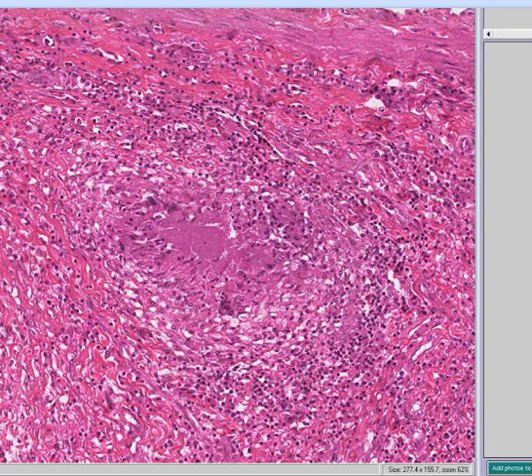First person to see liver, let me know. Oh, don't tell me you don't see liver yet, because I know that our dim is still on. Nobody sees liver?